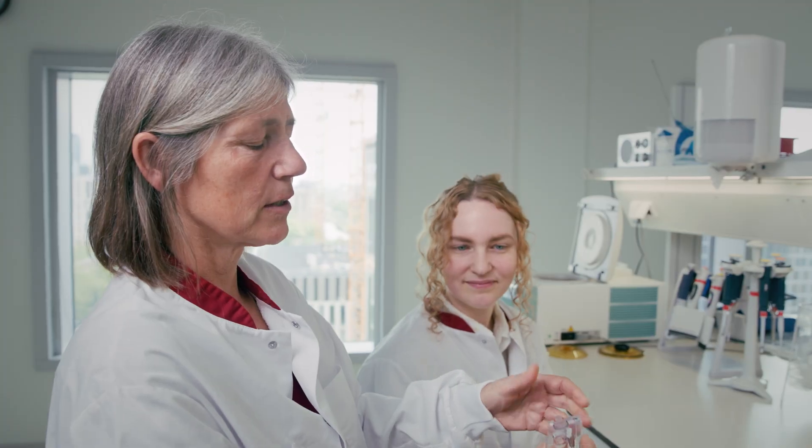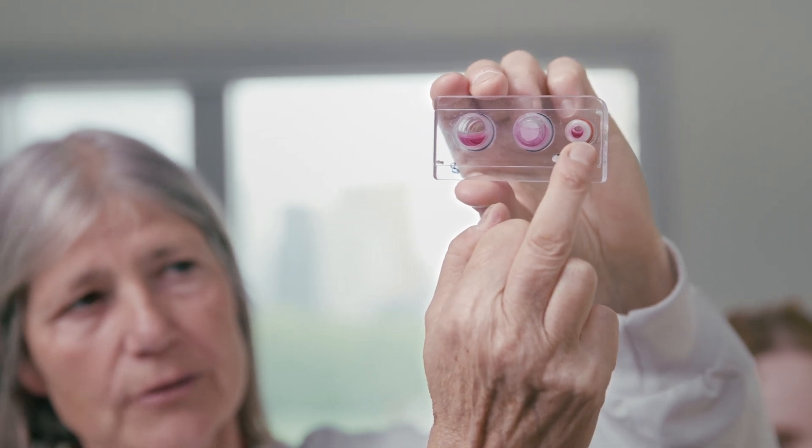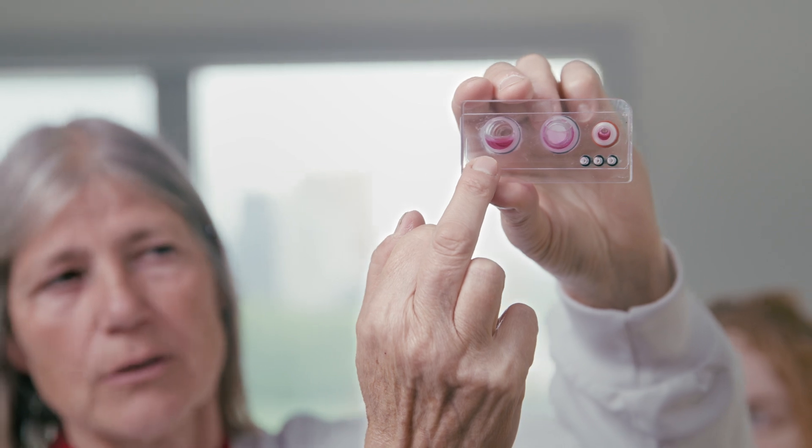It's called a chip because it's actually a sort of bioreactor. This is the chamber where the skin is, and here we have a chamber where the reserve medium is. And this is another chamber where you can put another organ of choice.